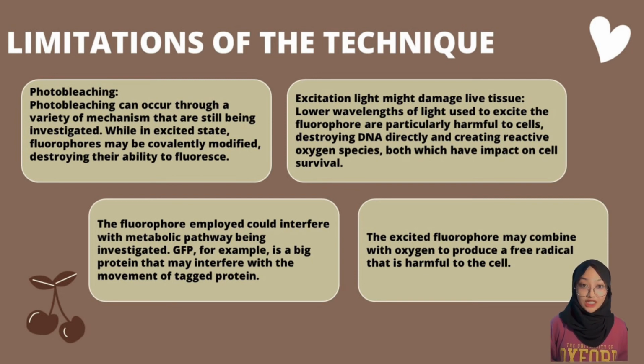Okay. Another limitation, the fluorophores employed could interfere with the metabolic pathway being investigated. For example, GFP is a big protein that may interfere with the movement of the target protein. Last, the excited fluorophores may combine with oxygen to produce free radicals that are harmful to the cell.